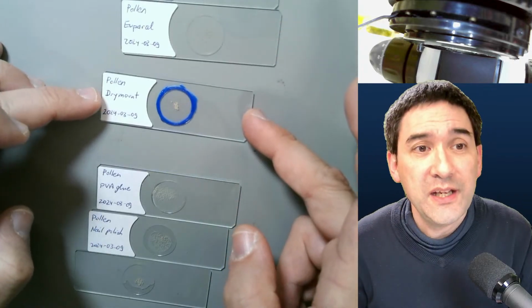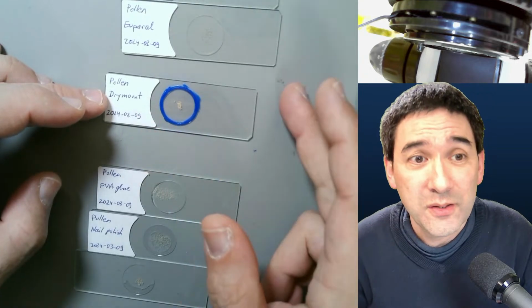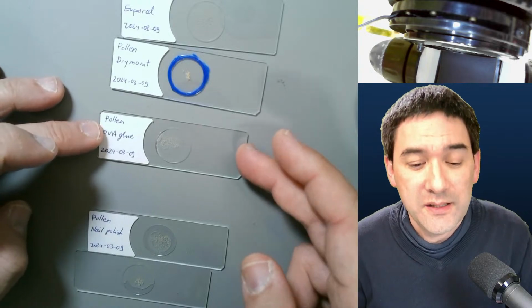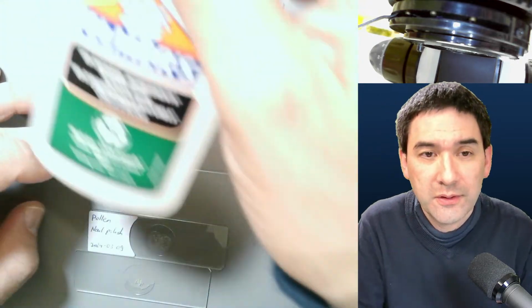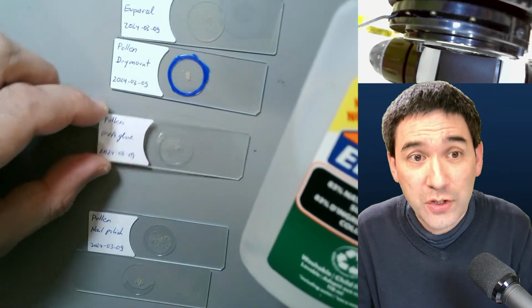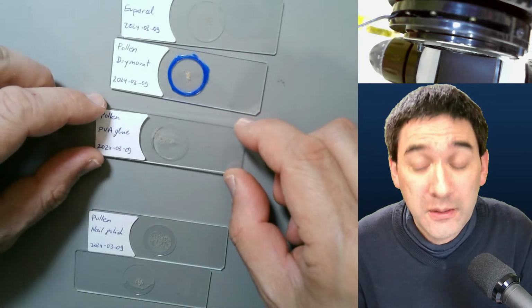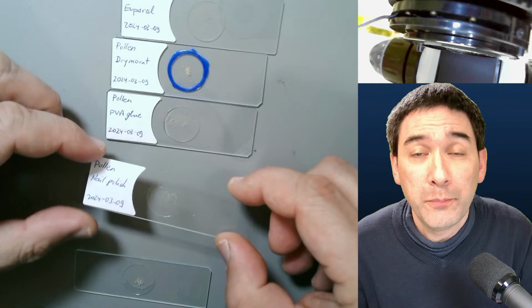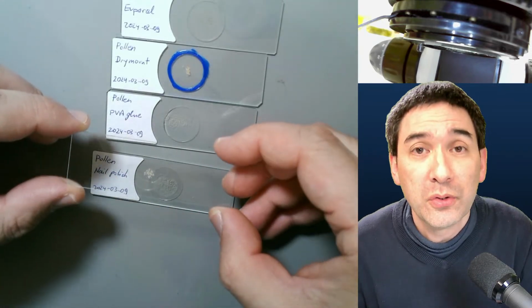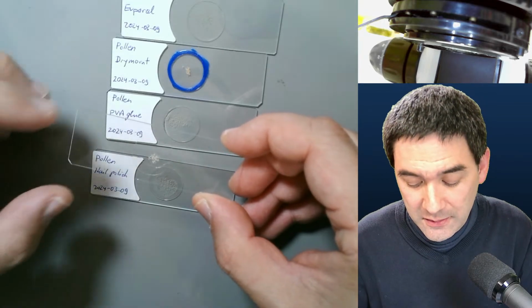Okay, this here is a dry mount, basically mounted in air. So the pollen in here is in air. The blue ring is, of course, one I made with a slide ringing table to keep a little bit of distance here. This here is starting to become my favorite one. It's PVA glue, this one over here. This glue is water-based, and I think this actually works very well because it retains the natural shape of the pollen. And this is nail polish, which is the worst one because it likes to shrink a lot. And this here is mounted in pure glycerin, or pure glycerol. So you see it's a tiny drop there. All of them are pollen.